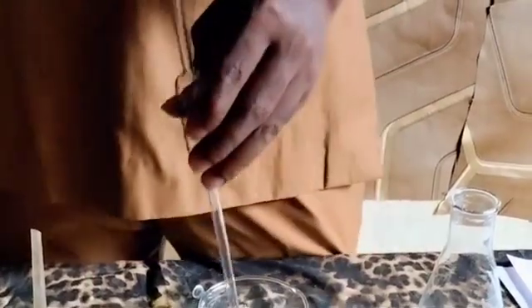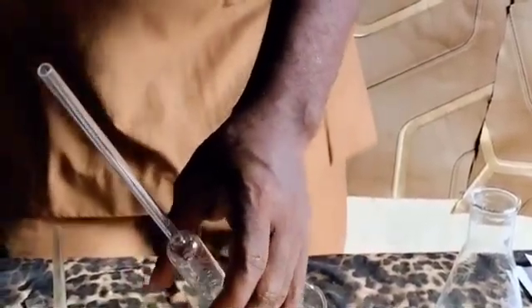So having done that, just stick it at the bottom. We now get the indicator, collect the freshly prepared methyl orange, and take only 2 drops into the base. Turn it, check it, it is yellow in color. So next, we start the titration experiment.